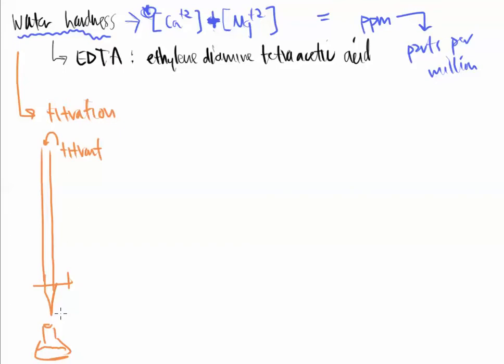We want to report total water hardness, so it's very important that you go through the calculations with as much accuracy and as much precision as you possibly can, because we are reporting these numbers to someone if you're doing this during our water study analysis.